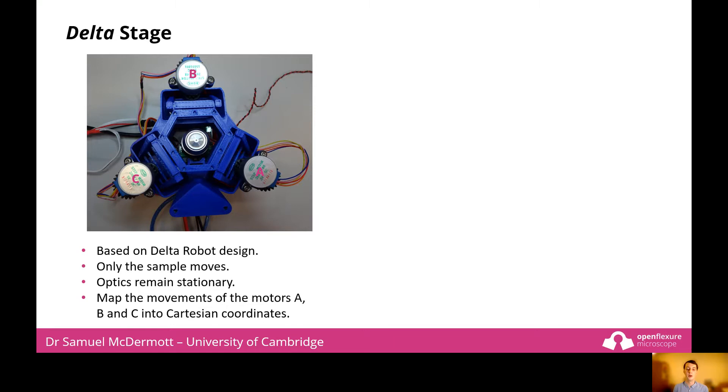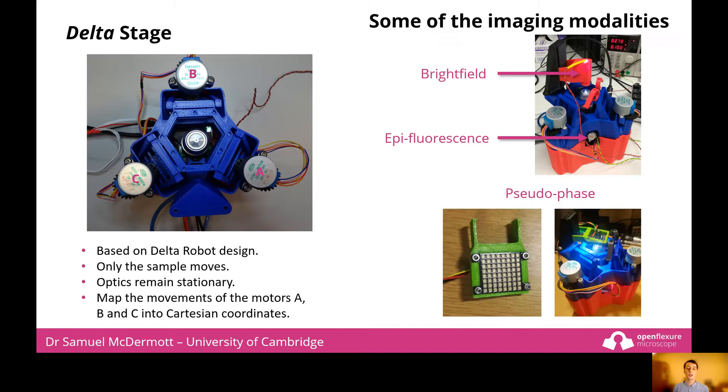The software maps the movement of the three motors, A, B, and C, into Cartesian coordinates X, Y, and Z. Because of the modularity of the design of the microscope, we have been able to develop several different imaging modalities.